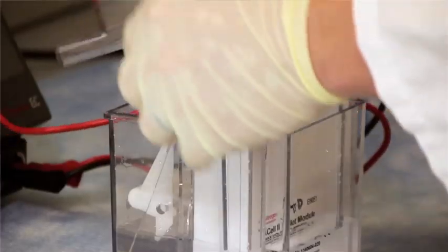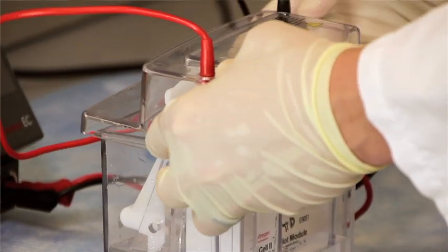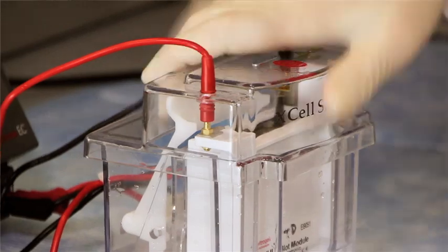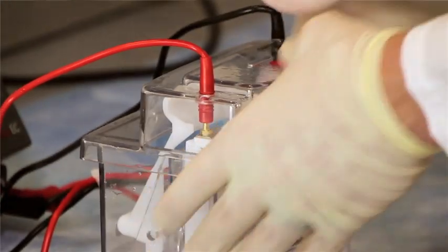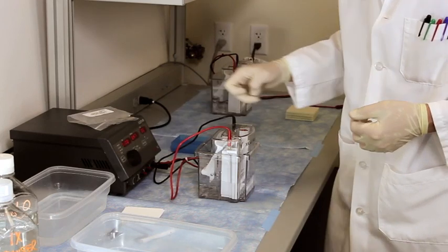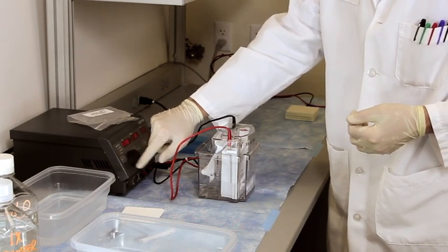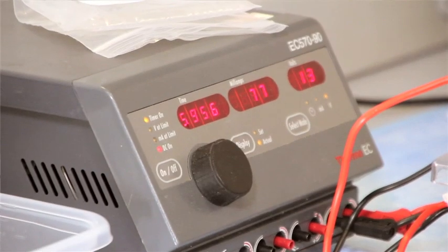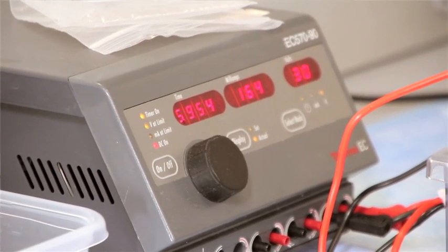And now we're going to put the lid on top of our XCell and set our voltage for about 30 volts and one hour. Get our timer started. And we've got about an hour before we're moving on to the next step.